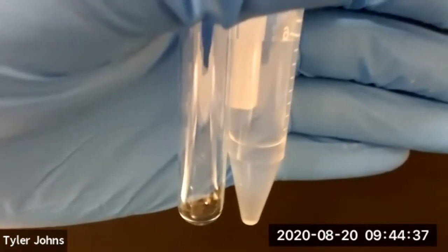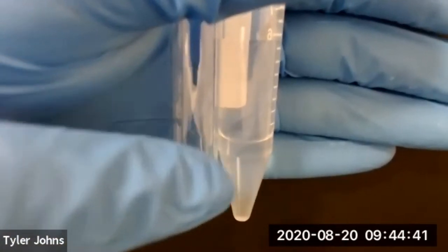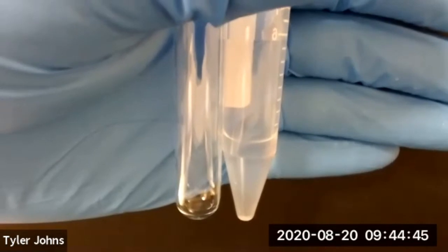Once the layers have completely separated, we'll transfer the bottom organic layer to a clean test tube using a pasture pipette.